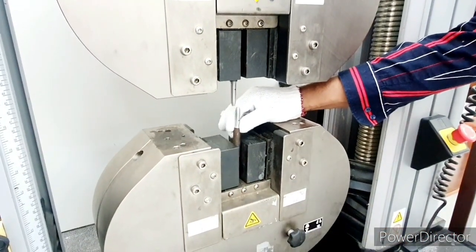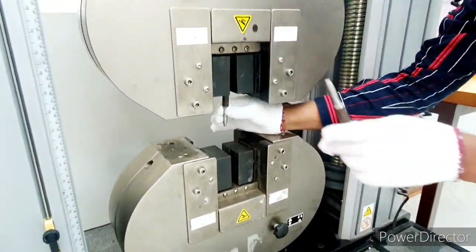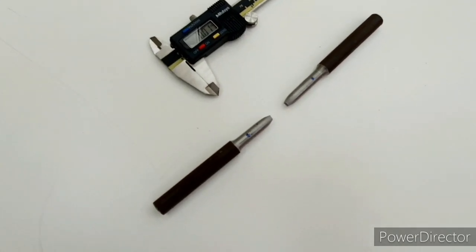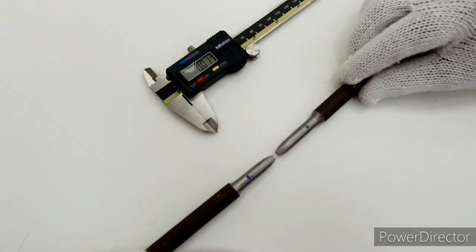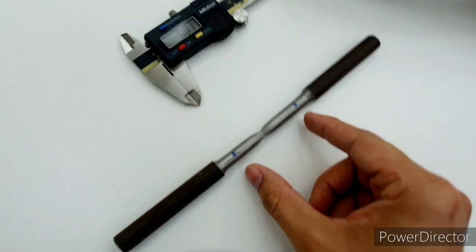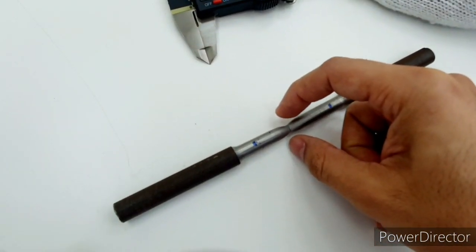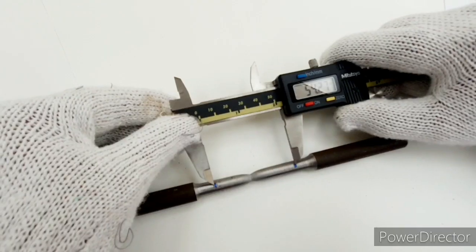We have to unmount the broken sample and measure its final length as well as final diameter. Here we are joining the broken sample pieces together, and after joining we will measure the final length from the same two original points, which will give us how much the sample has increased in length, as well as we will measure the neck diameter, to see how much the area has reduced.